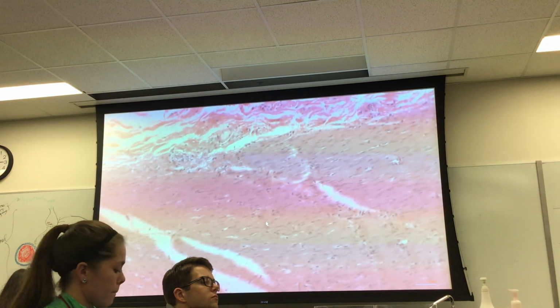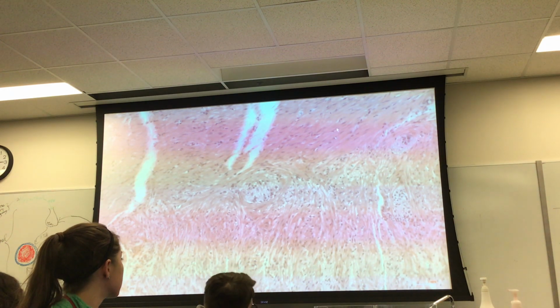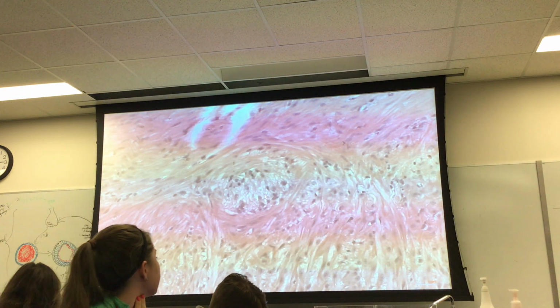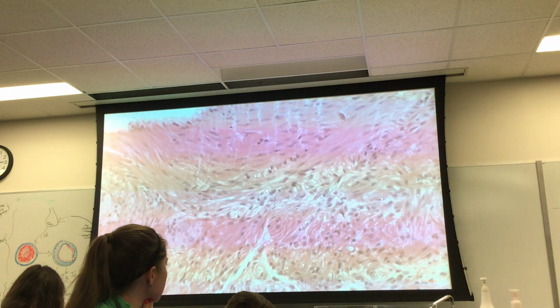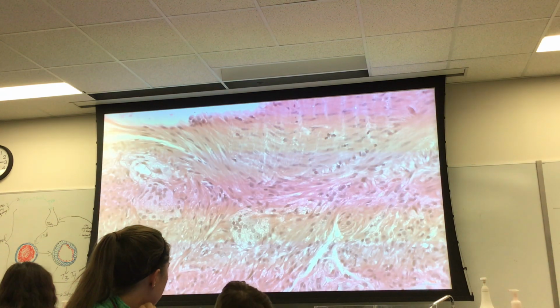And if we go down here, now we can recognize smooth muscle, and if we go down here to this interface between this, which is muscle cut in one way, and this is cross cut, these nervous structures here in between, again, a pocket of something that looks completely different like this. In fact, if we look along this interface, maybe we'll see some examples of actual neurons in here, like this one.